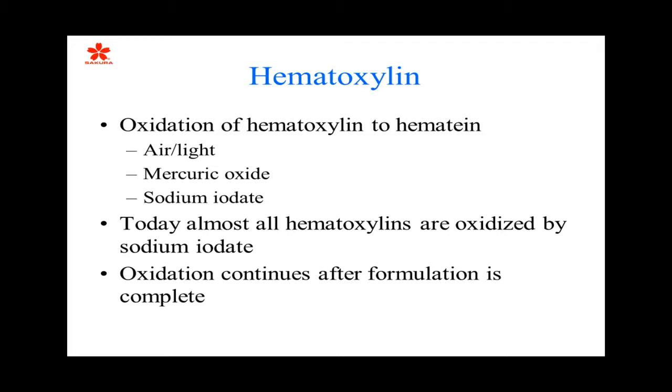Oxidation, this is something that we see a lot, especially in your stronger hematoxylins such as Harris. Oxidation of the hematoxylin will happen just from light or air, and this is one reason why, if you're using something like Harris's, we keep that covered in the evening. We don't just let it continue to be exposed. Mercuric oxide or sodium iodate is often used in making the solutions to oxidize the hematoxylin. Almost all hematoxylins are oxidized today by sodium iodate, but the third bullet is the most important: oxidation continues after the formulation is complete.